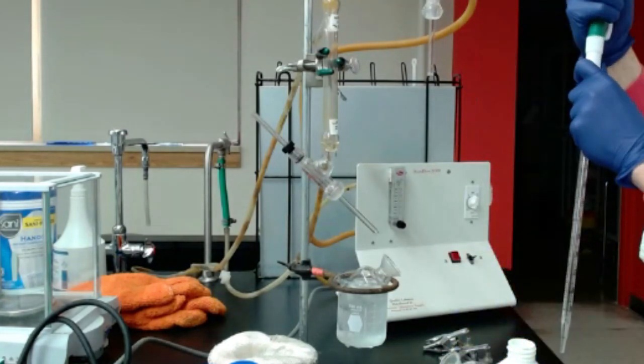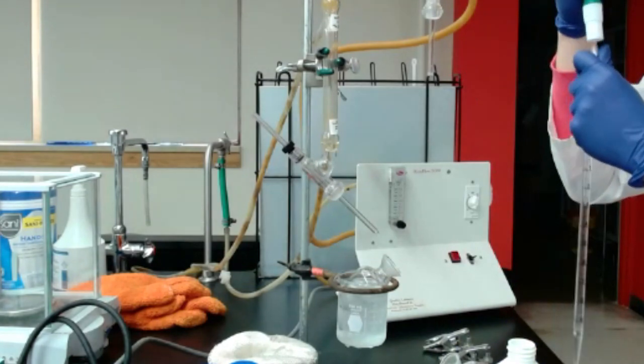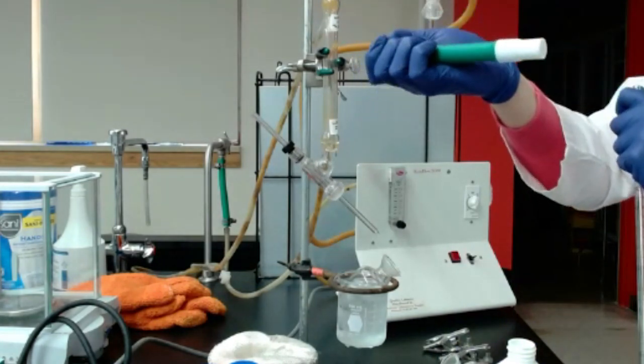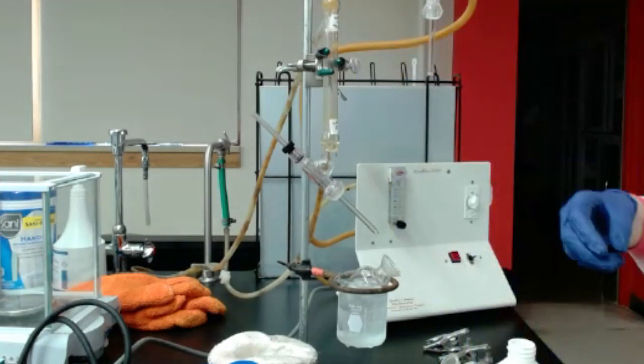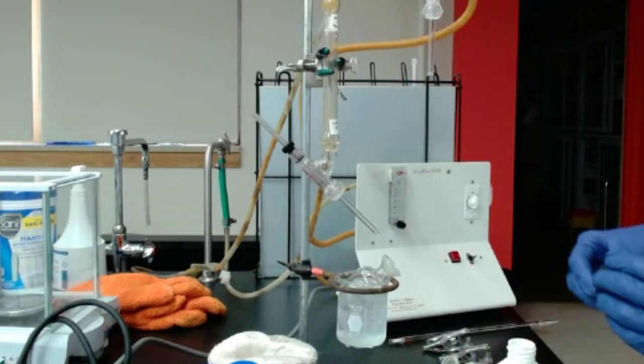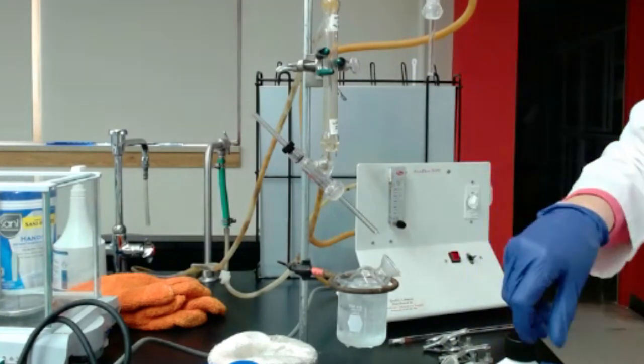Then make sure you keep that pipette straight, because if you move it, you might have some going into your pipette pump. So make sure you don't turn it in the other way.